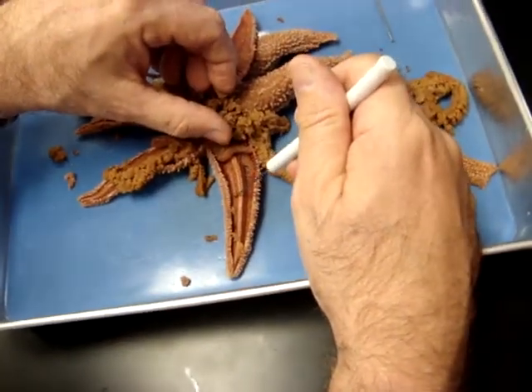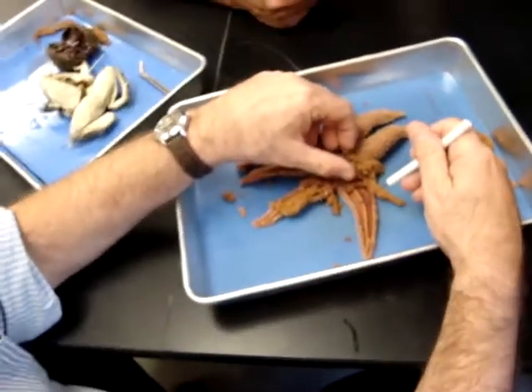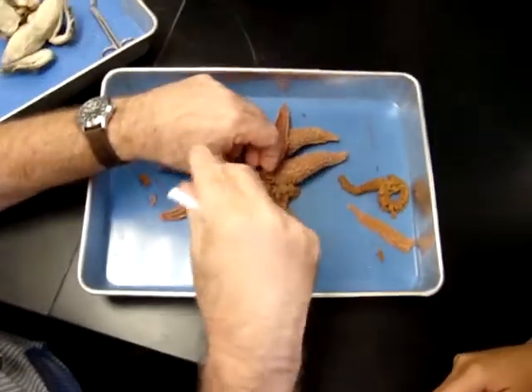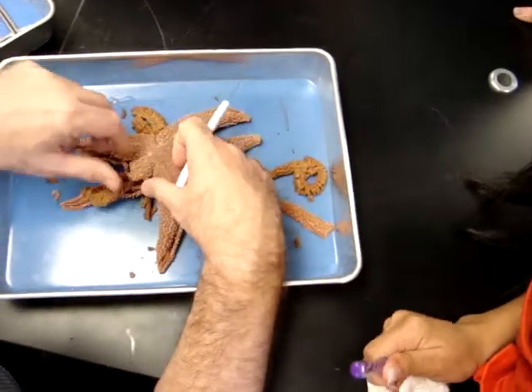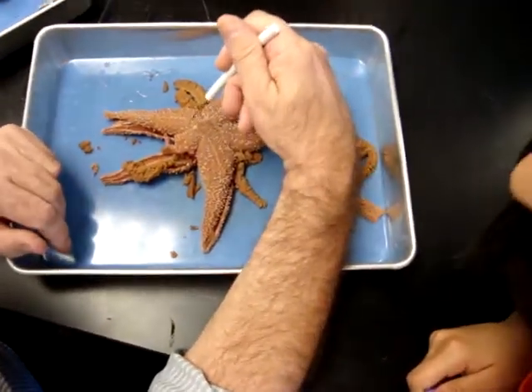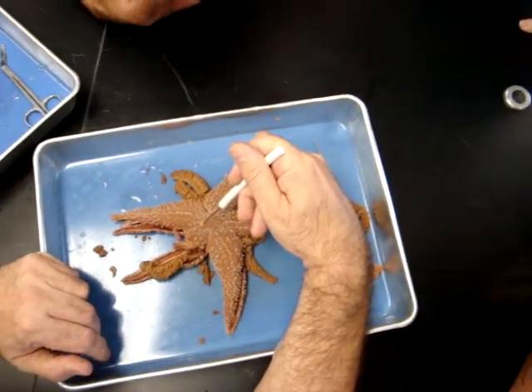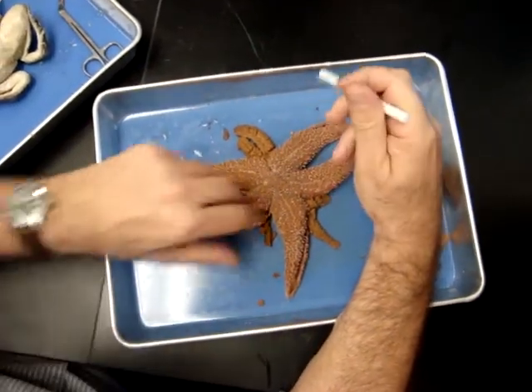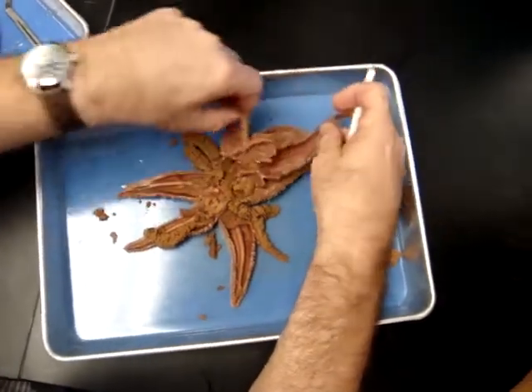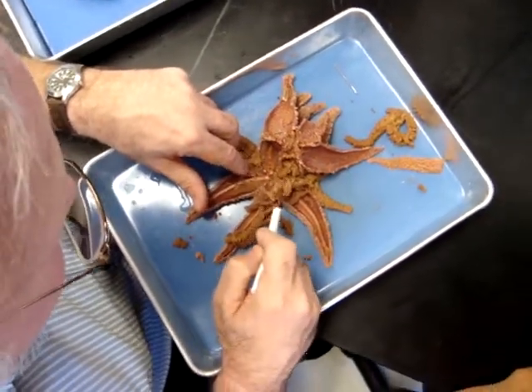Those are ampullae. What is the function of the ampullae? No. Water vascular system, remember, they are the little bulbs at the end of the podia. They contract and force water into the podia tube feet, and then the tube feet move. Remember, what are we talking about? The water vascular system. Water goes into the, what is this structure called? Madreporite. And then into what canal? Stone canal. Okay, so here we go. Into the stone canal. We believe that the stone canal got clipped.